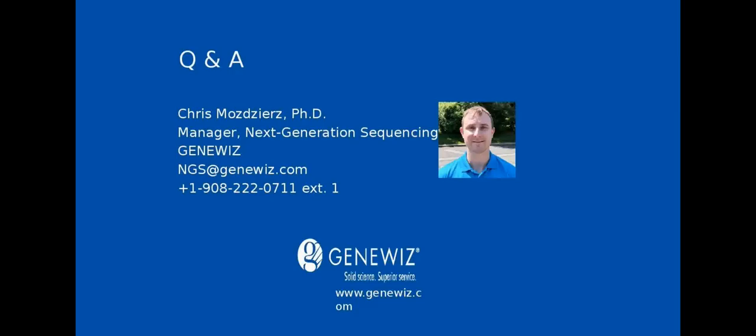Next question from the group is, you spoke about phage display library screening. Can I use a similar approach for screening aptamers, which are quite small? The answer is certainly. One advantage of NGS is that sequencing starts right after the sequencing primer binds, and the sequencing throughput is very, very high. And my understanding is aptamer libraries can have quite high diversity.